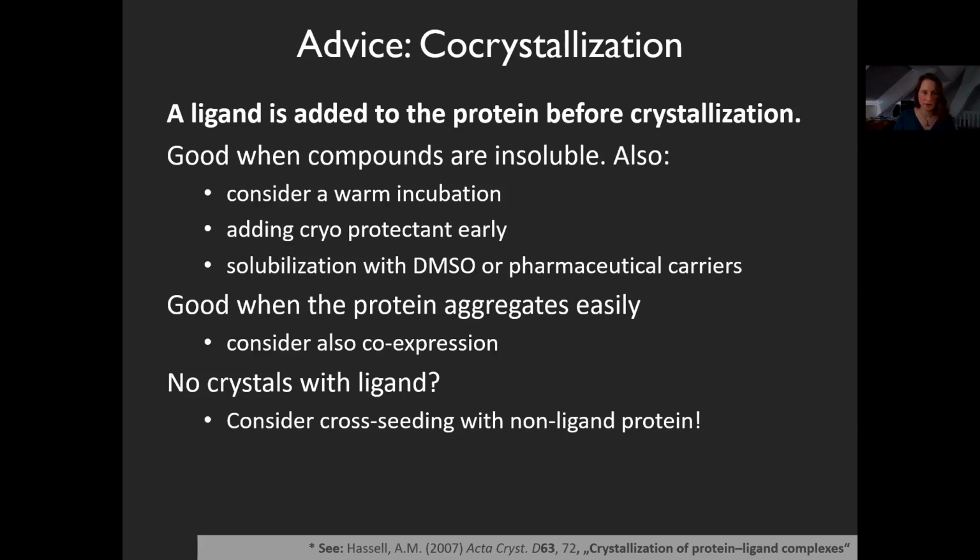You can consider a warm incubation of the protein before you dispense it. You can consider adding the cryoprotectant early if your ligand is particularly hydrophobic. Solubilization with DMSO or other pharmaceutical carriers. There are, for example, big ring-like structures that are used to bring drugs into human bodies that are lipophilic. You can also use them for co-crystallization.